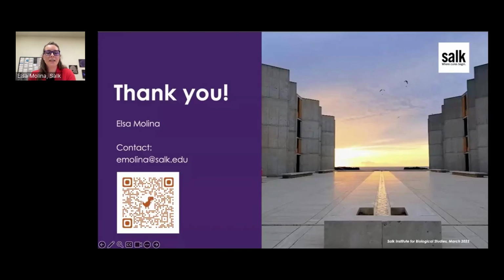But maybe, I'm not an engineer specialized in this type of technology. Maybe the resolution is correlated with the reliability of the technology. So I'm not quite sure. But for me, it's more important to know if the data are true and if those genes are really expressed in this type of cells, instead of how deep I can go within the cell.